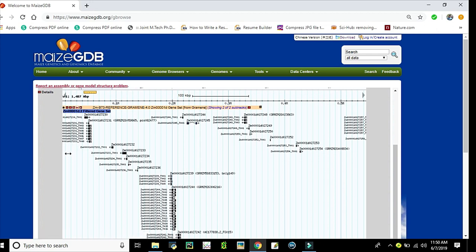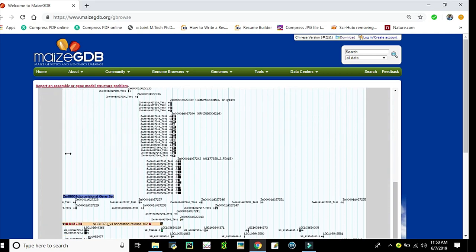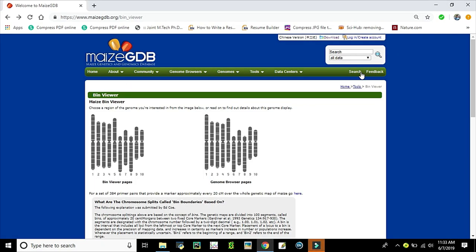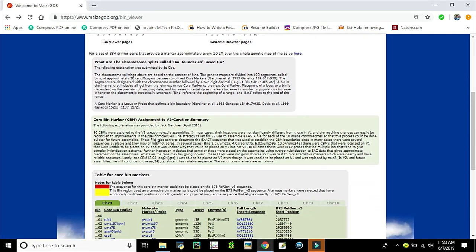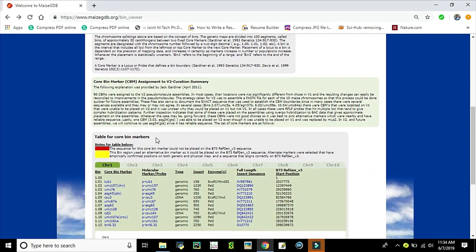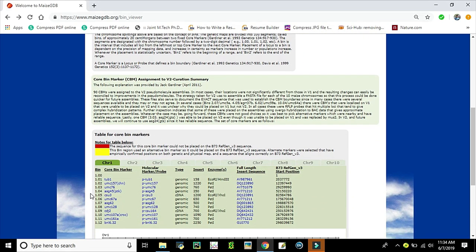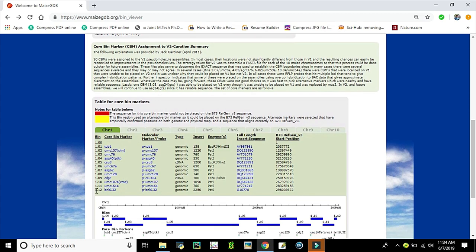BinViewer is a user-friendly navigation tool. It displays 10 chromosomes with their bins. Bins are segments of chromosomes that are 20 centimorgans each. Each bin is characterized by core bin markers. For example, bin 1.12 has BNL 6.32.